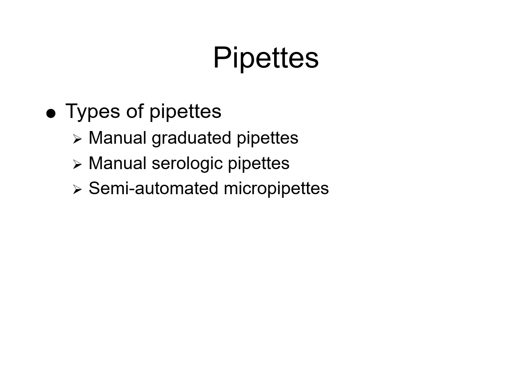And then we can also use semi-automated micropipettes. These are adjustable or fixed volume pipettes designed for small volumes like a microliter with high precision. These are ideal for ELISA, immunoassays, and other microvolume procedures. It actually helps reduce human error and increases reproducibility.